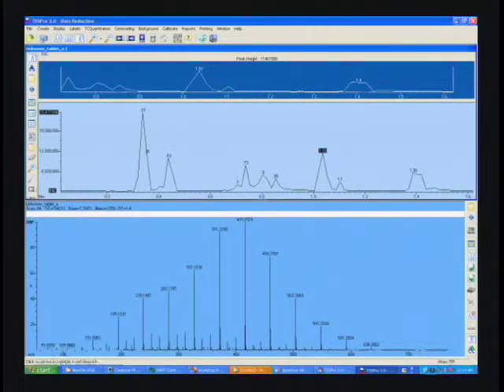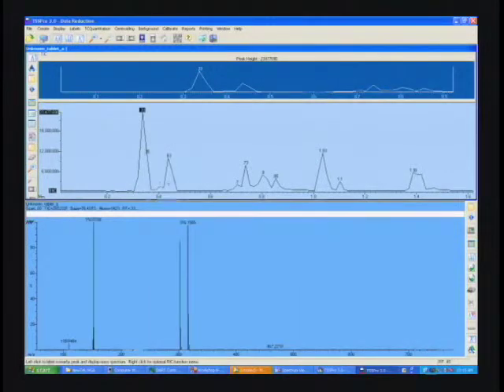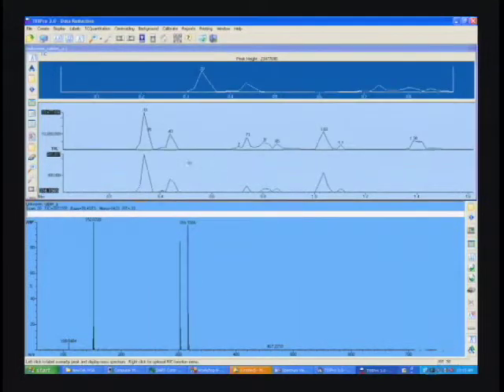We know the exact masses for each of these reference peaks, so the software finds those. Curve fits the time versus mass profile. If the curve fit is good enough and the fit is within certain tolerances that we specify, it just automatically saves that in the data file. So anything I look at here is going to be correctly calibrated.